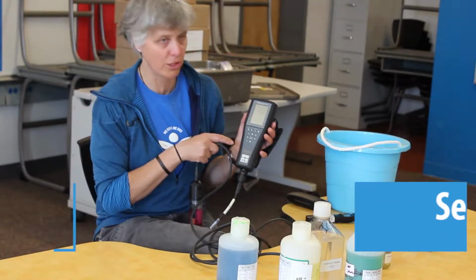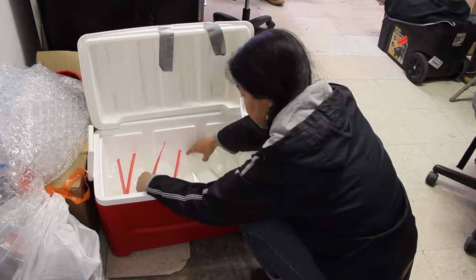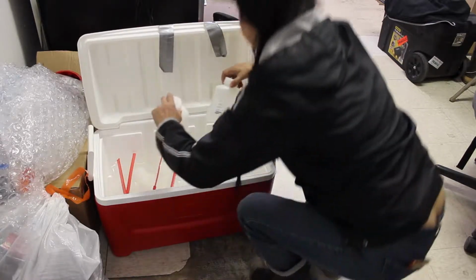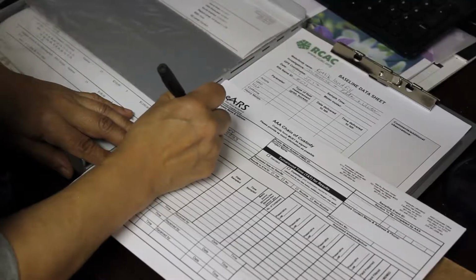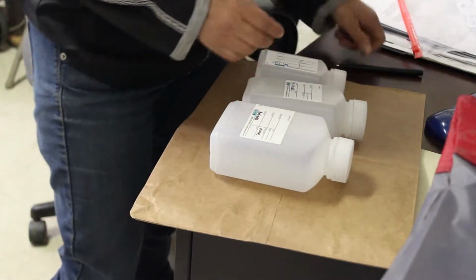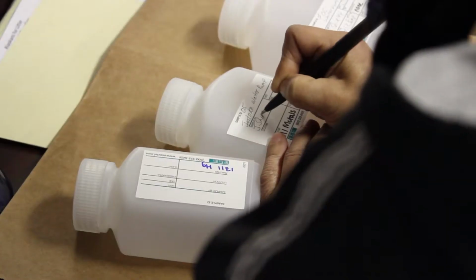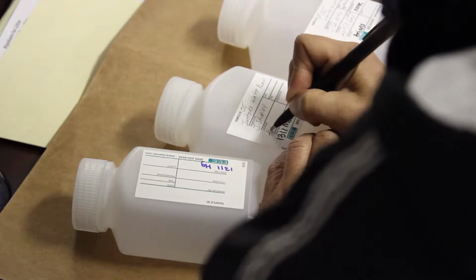Once your equipment is calibrated, get all your forms and sampling bottles in order. The laboratory you're working with will provide you with all the bottles and forms you will need. Fill out as much of the info as you can on the forms and bottles before heading out to minimize the amount of time spent at the landfill. And it's always easier to complete these tasks in a nice, dry, warm office than outside in unexpected bad weather or with lots of mosquitoes.